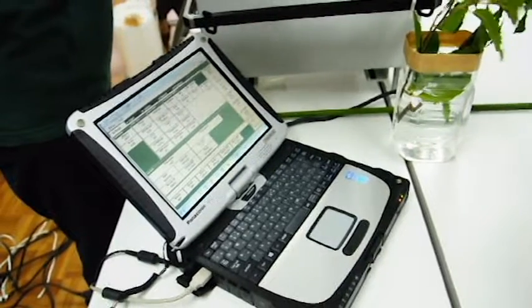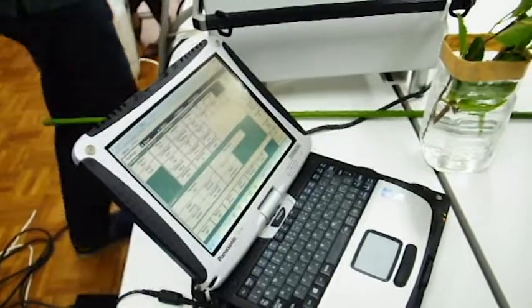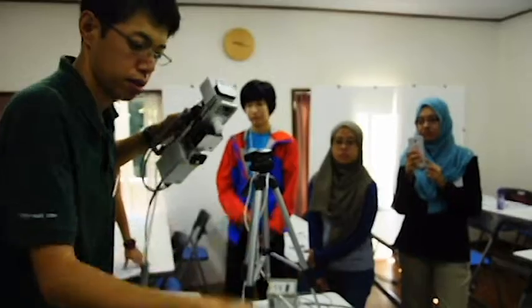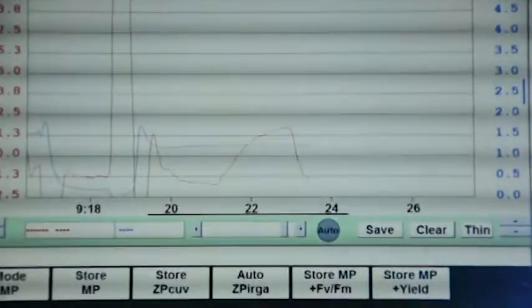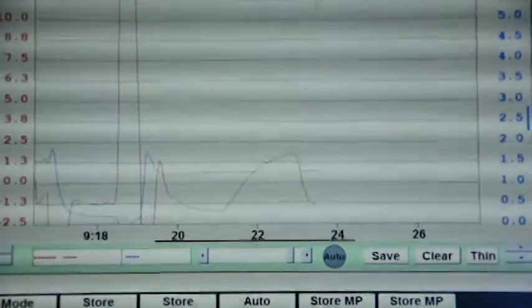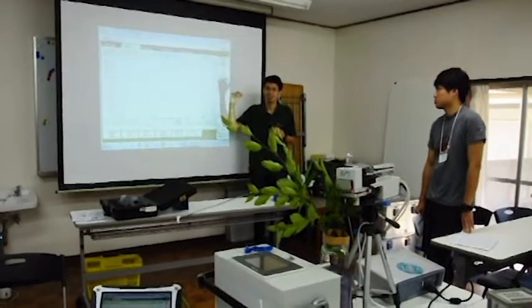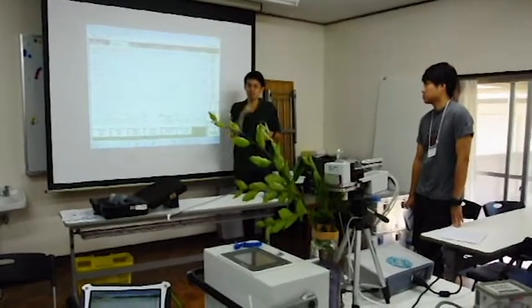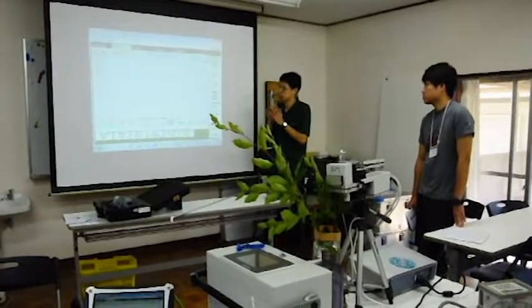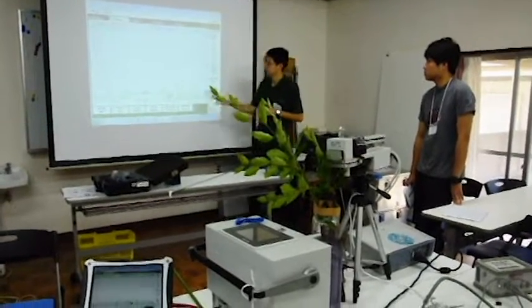Okay, so from now we start to measure the photosynthesis. Photosynthesis absorbs the CO2 and respiration releases the CO2, so the direction is the opposite. Photochemical response, light transfer, you know the speed of the light is very fast.